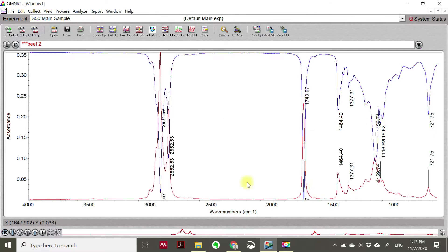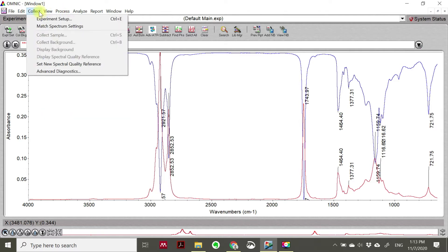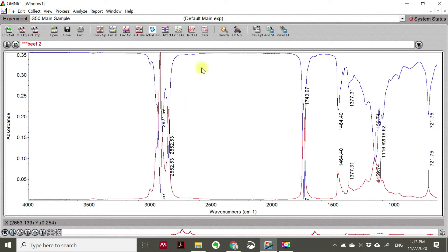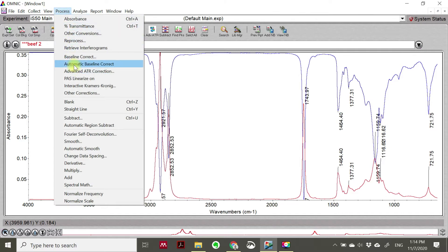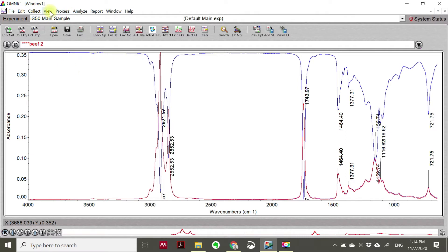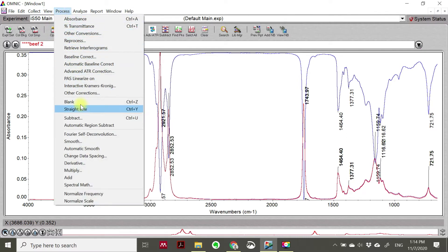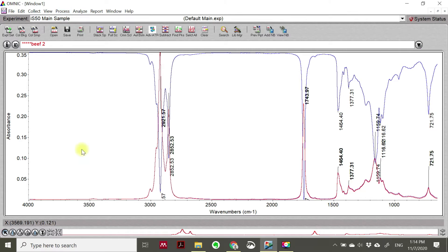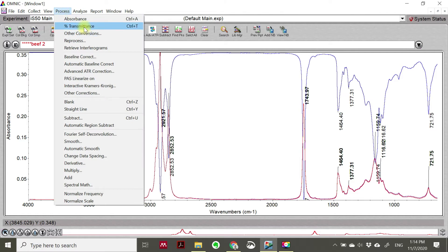You can see the spectrum changes after the processing is done - correcting the spectrum into a transmission spectrum. They change the data from transmittance dataset to absorbance dataset. The red one is the processed one. Then you have to process next into Automatic Baseline Correction, and then another process - you can choose Automatic Smooth.